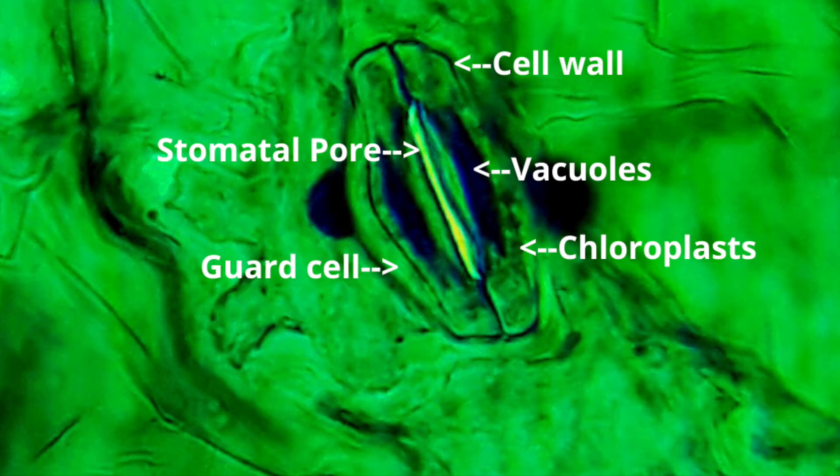There is the stomatal pore which opens and closes by changing the shape of the guard cells. They control the size of the stomatal aperture or the stomatal pore. Chloroplasts are the tiny spheres that we can see inside the guard cell.